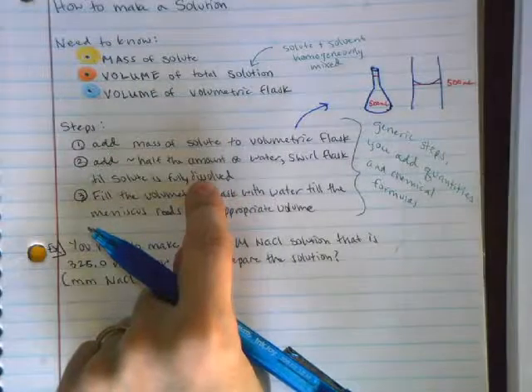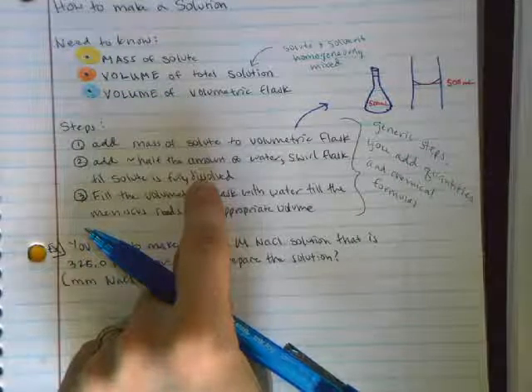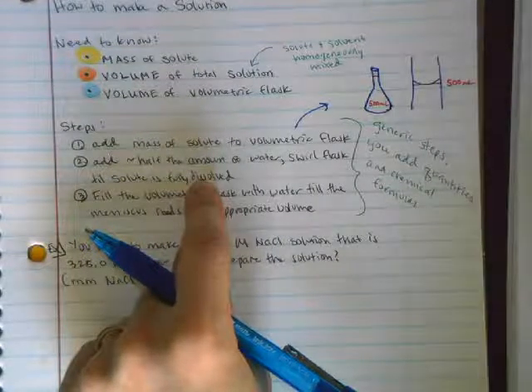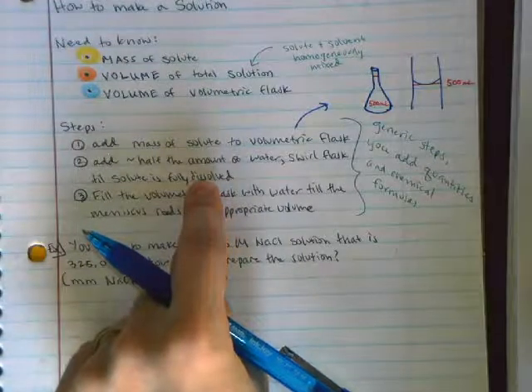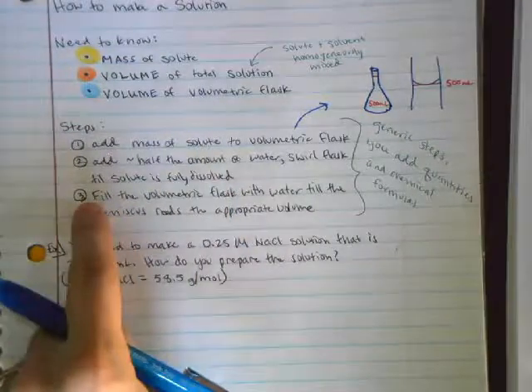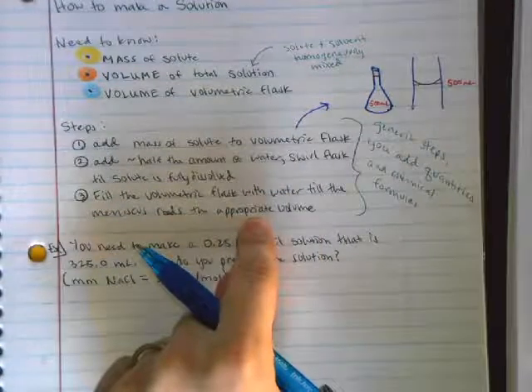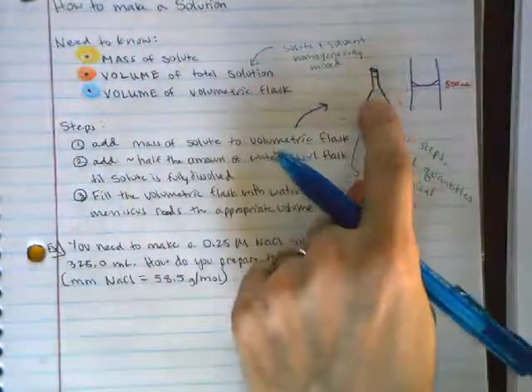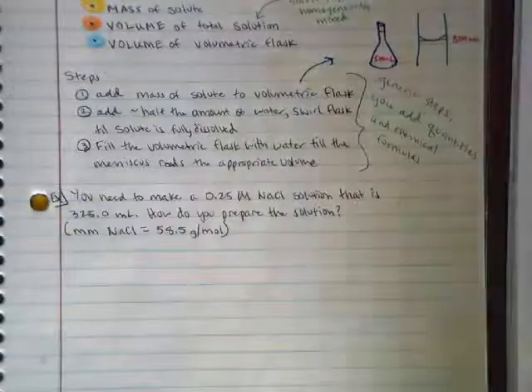By dissolving the solute, I am allowing it to change the volume that it occupies. When something is in its solid phase versus when it's dissolved, the volume is different. I want it to fully dissolve so that I don't experience that change later on. Once my solute is fully dissolved, then I'm going to fill the volumetric flask with water till the meniscus reads the appropriate volume. Nowhere did I actually measure water. I measured my total volume of solution because everything is fully dissolved in here.